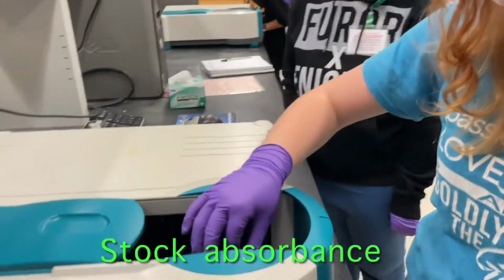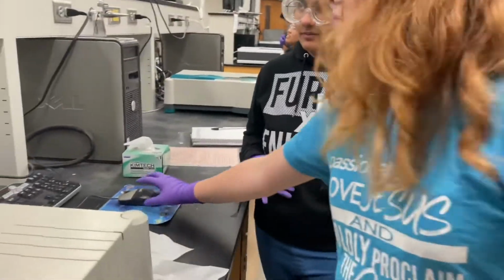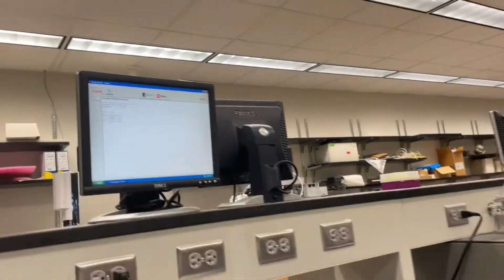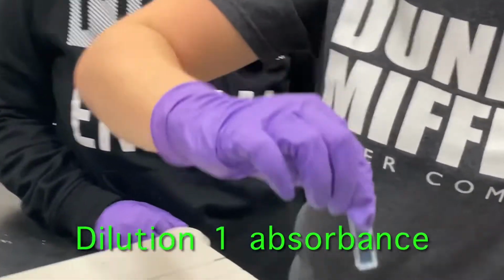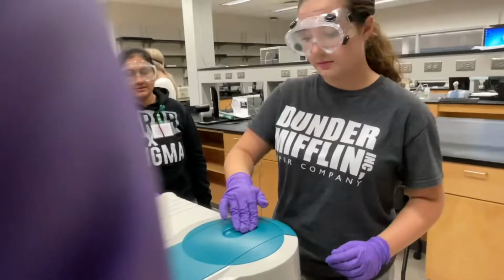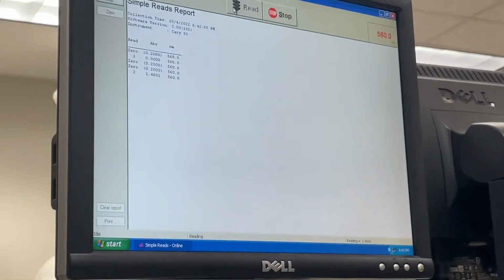After zeroing the spectrophotometer with the water, we decided to take the stock solution's absorbance value first. We cleaned both sides of the cuvette and then placed it in the spectrophotometer. Next, we took the absorbance value of dilution 1. We did the same as before, cleaning both sides of the cuvette with the paper and got the absorbance value.